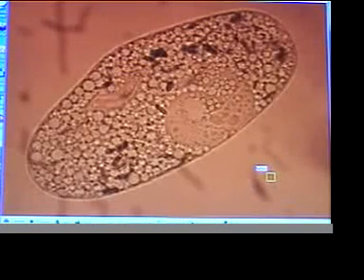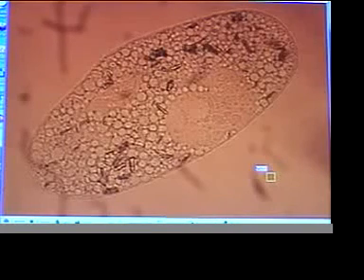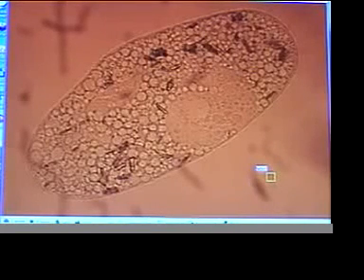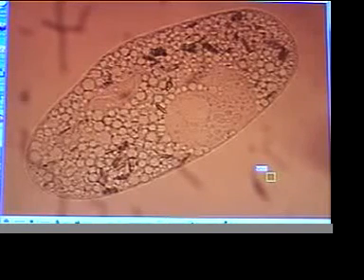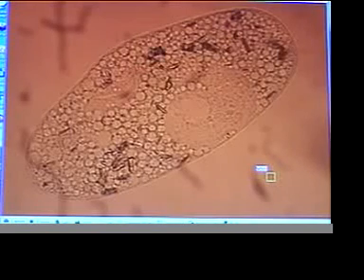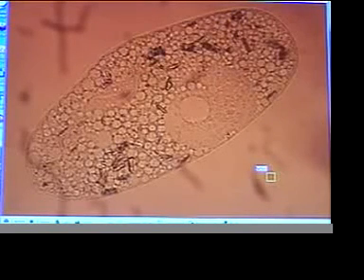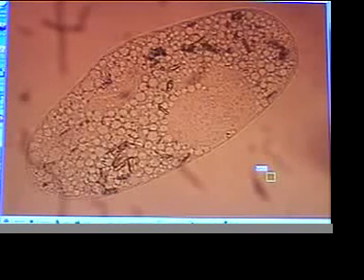We've seen these spheroid structures before with Blepharisma. You can see the organism is riddled with these holes, or little spheroids. It's very possible these are formed by some kind of cavitation in the organism.